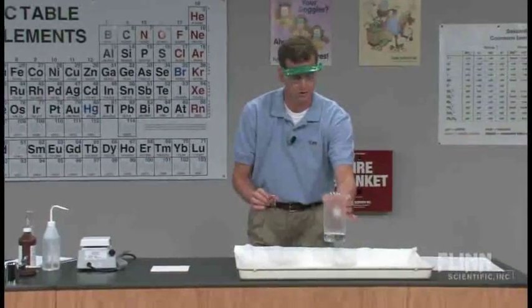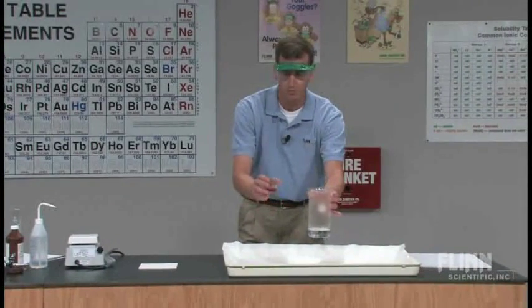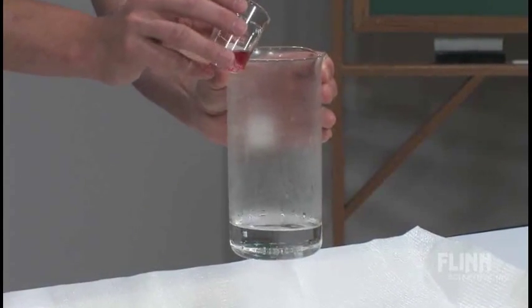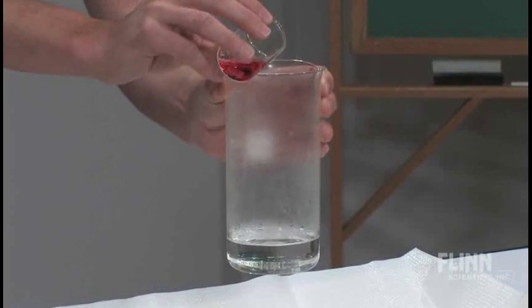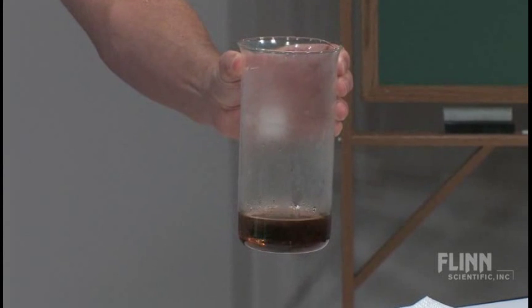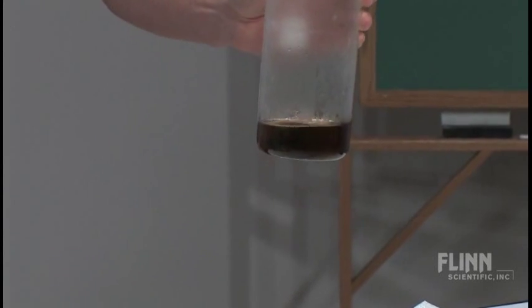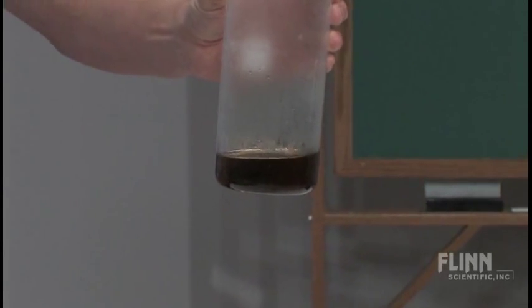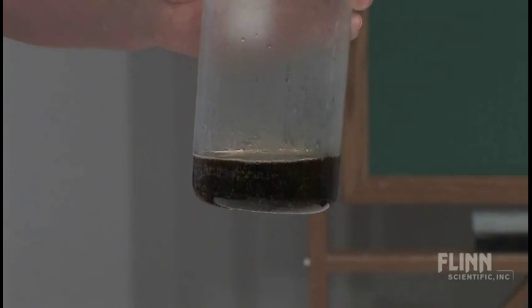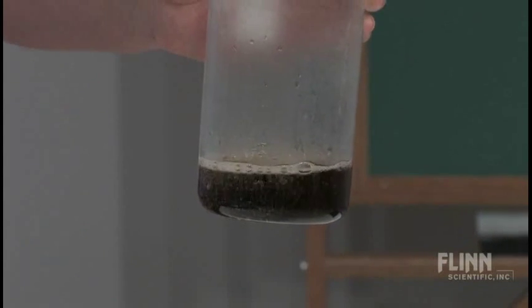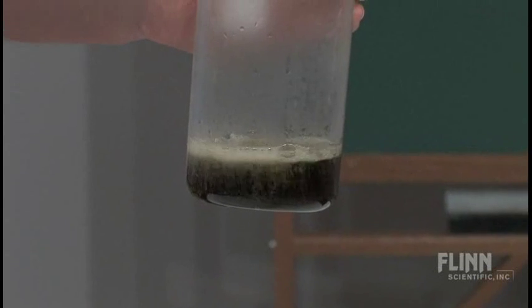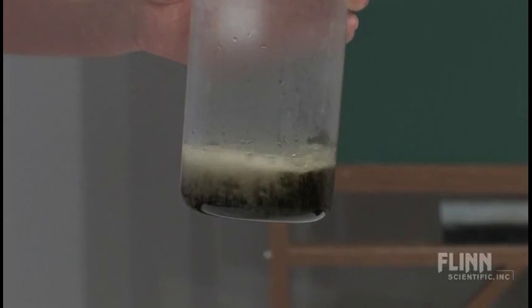Now, I'll let you decide for yourself, but I'm going to watch this. I'm going to pour this catalyst into here, and you're going to see a certain color change. It's pink now. As that reaction takes place, what color is that changing? That's a nice green color. The evolution of carbon dioxide gas increases quite rapidly at this point in time.